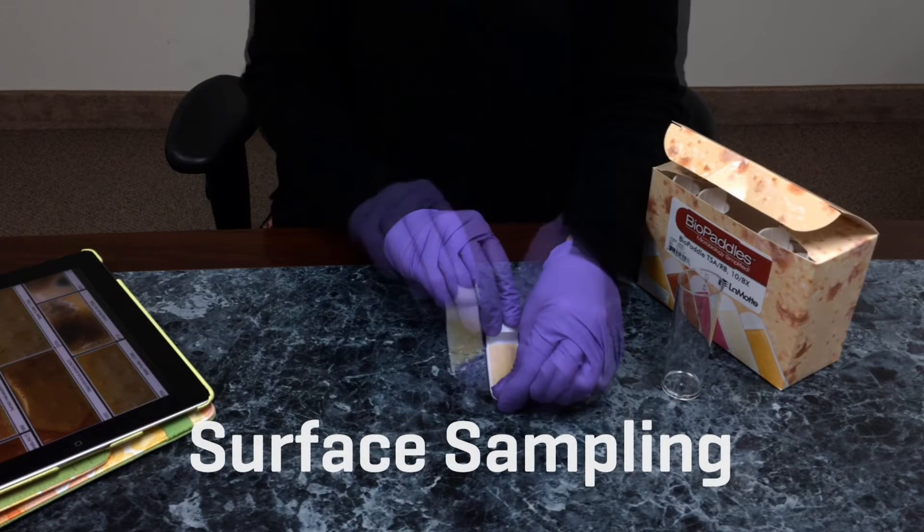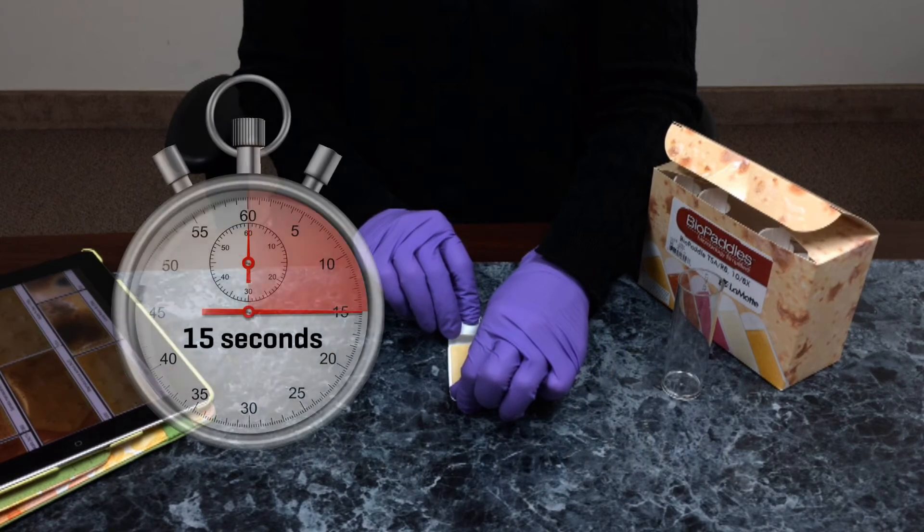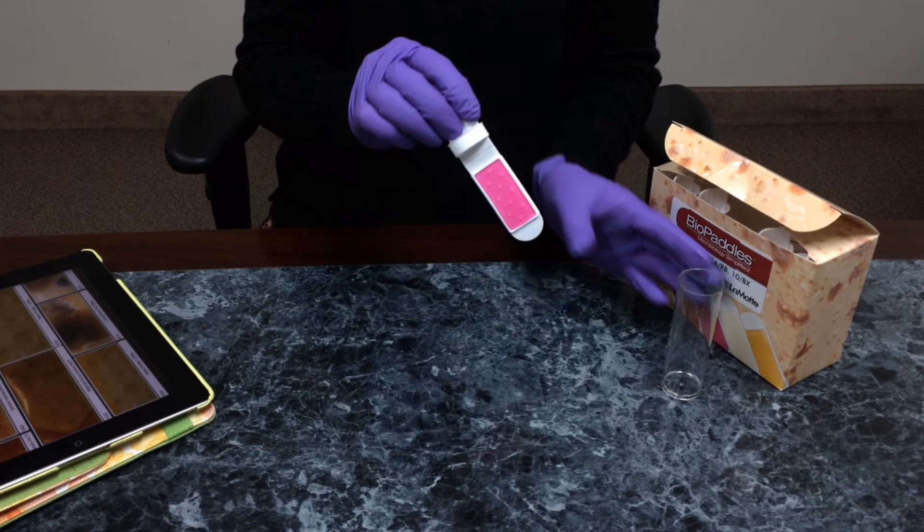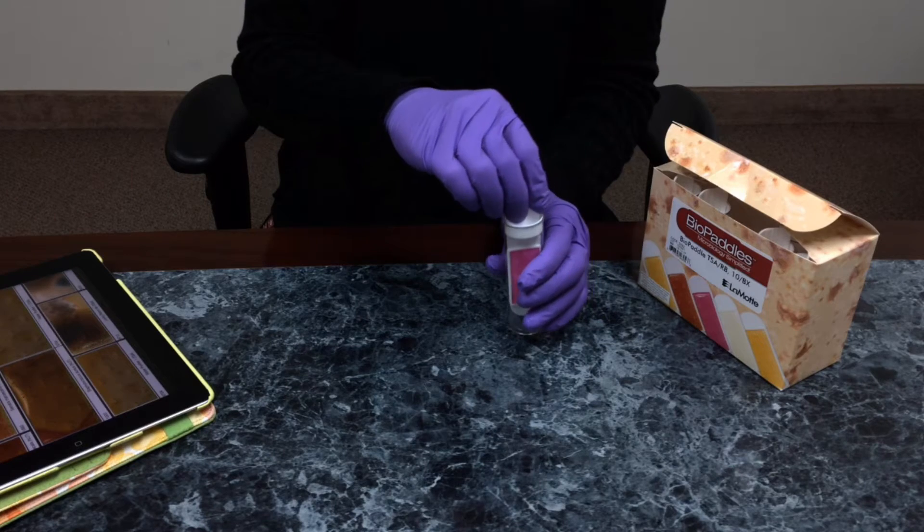For surface sampling, touch the paddle twice to the sample surface, allowing a contact time of 15 seconds. Replace the paddle in the vial and incubate following directions.